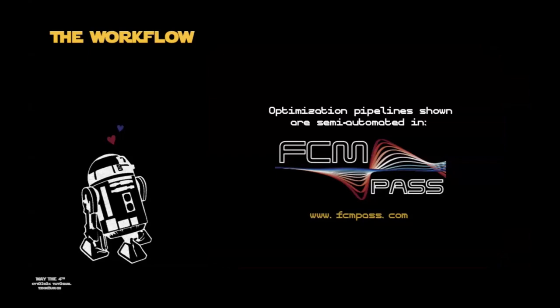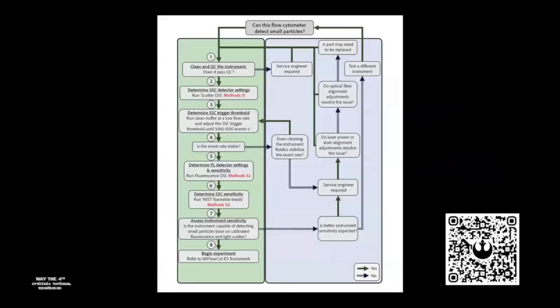It's called FCM Pass. It is free for academic use, but unfortunately not for those of you in industry. So this workflow is laid out in the first figure. We go through a series of steps that allow us to determine if a flow cytometer is able to detect small particles.